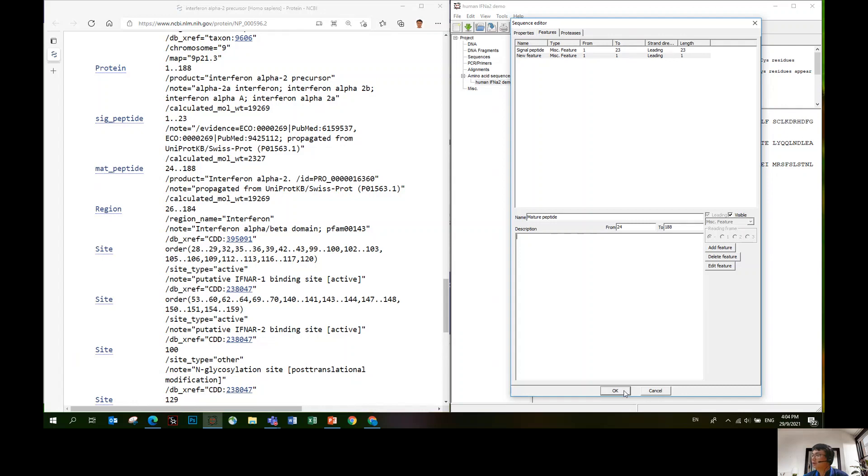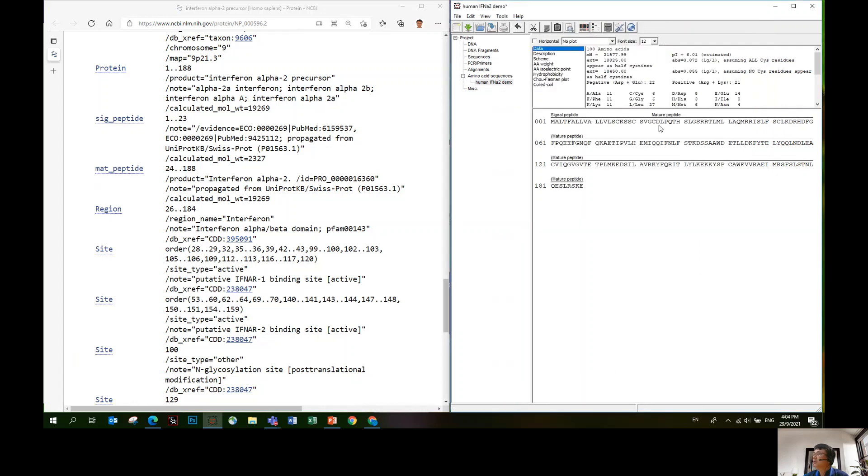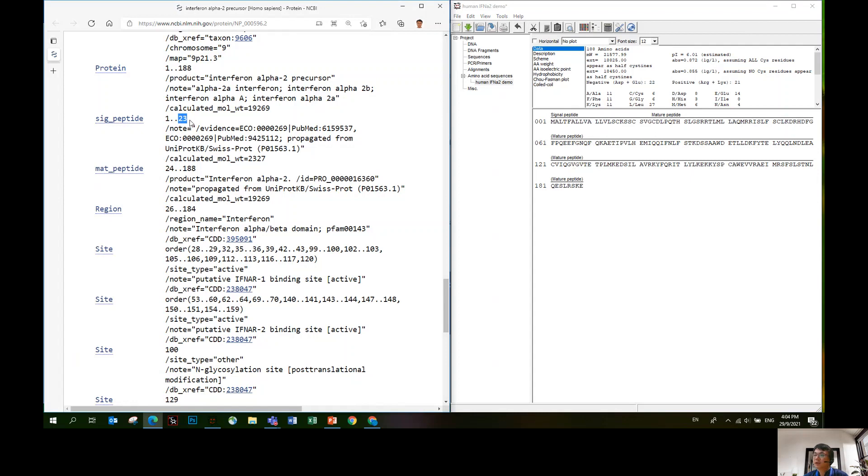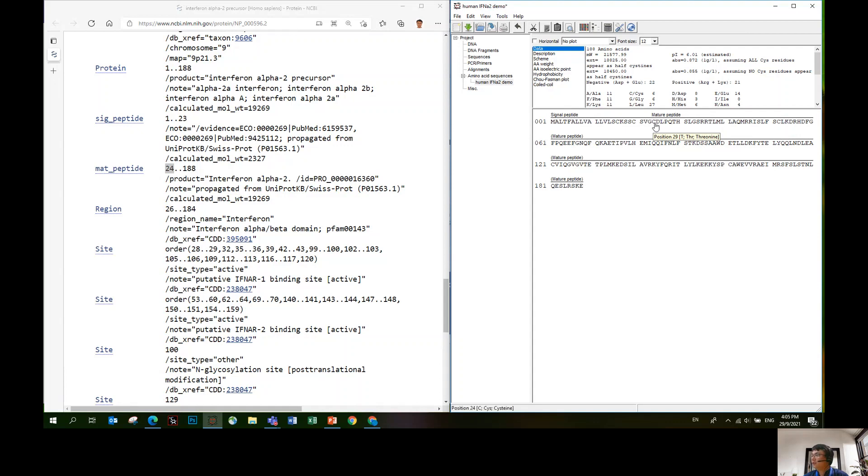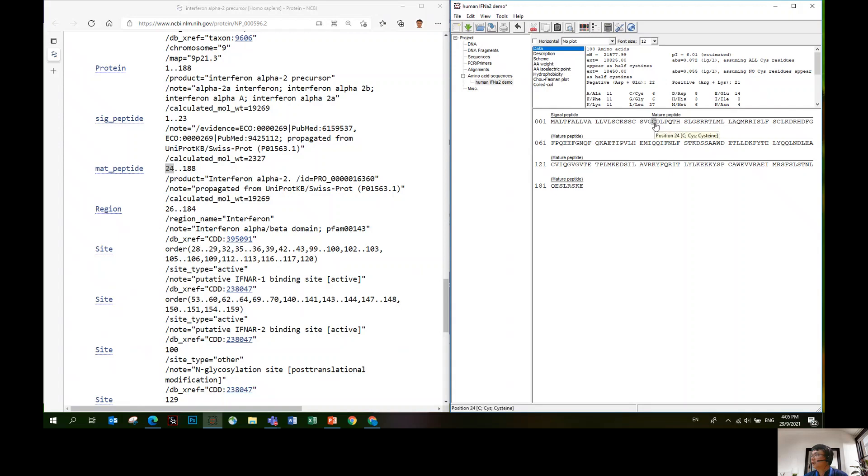You will see the feature will be directly on top of the sequence. You will notice, because these two features are back-to-back, they link continuously. There's no space between the two features. But the name of the feature will be directly on top of the first amino acid. You need to point directly to sequence 24. This is the start of the second feature.